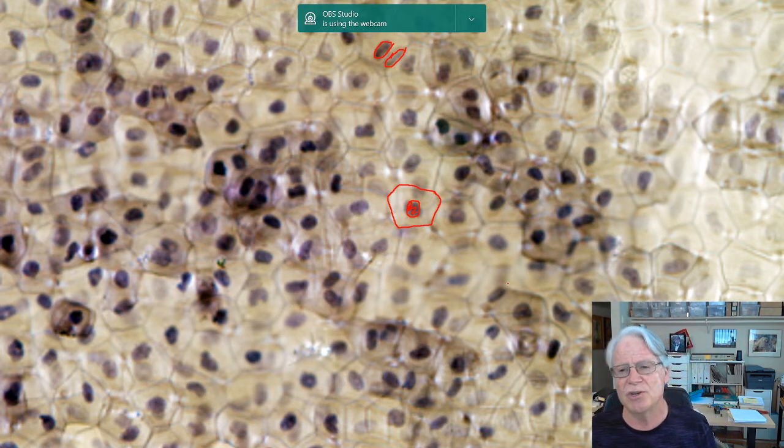And yes, we do. But what happened was, when they made this slide, the very thin layer of skin, this is a frog skin, got folded when it was put down onto the surface of the slide. So some of it folded underneath, and you're actually looking through and seeing the folded part underneath the original.